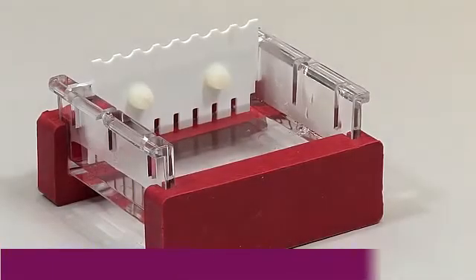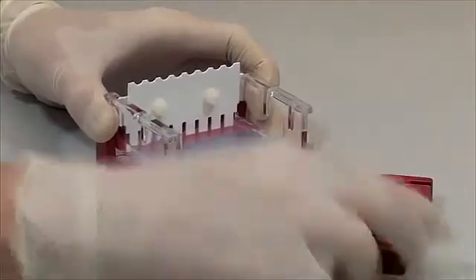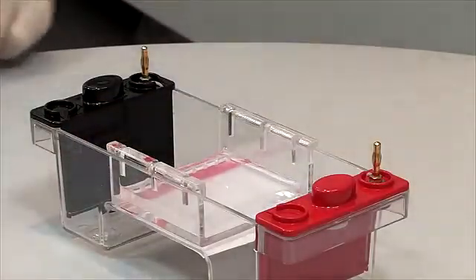Once set, the gel will become opaque. Carefully remove the casting dams before placing the gel within the tank. Gently remove the combs to avoid tearing the wells.